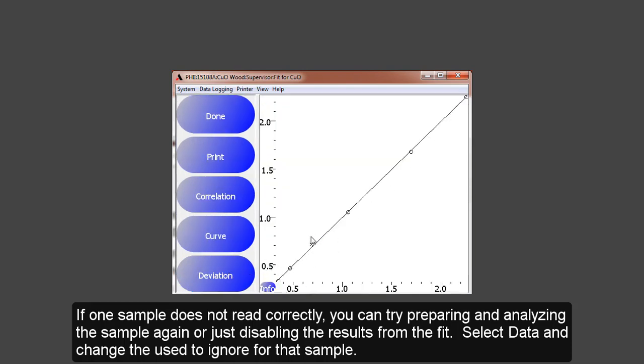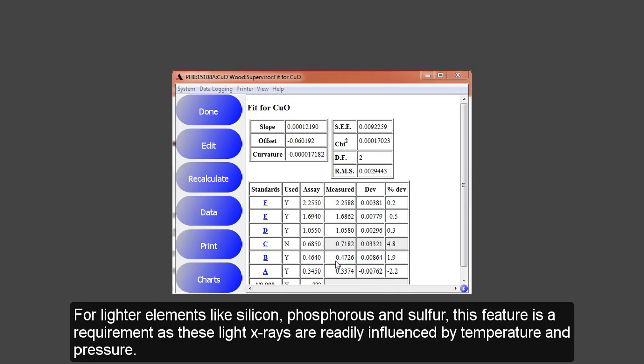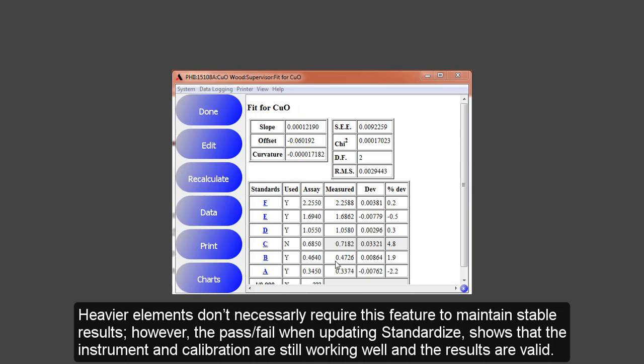Now the correlation plot is noted with the X. Once the fit is selected, you can set up the standardized feature. The standardized is used to prolong the life of your calibration and will correct for drift. For lighter elements like silicon, phosphorus, and sulfur, this feature is required as the light element X-rays are readily influenced by temperature and pressure. Heavier elements don't necessarily require this feature to maintain stable results.